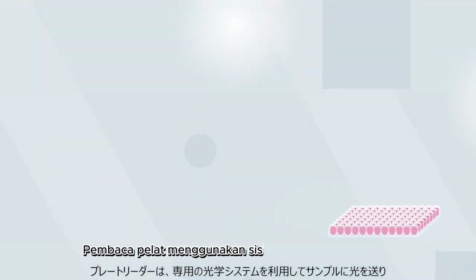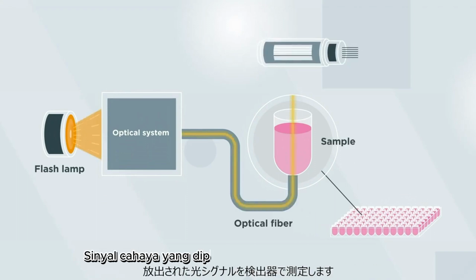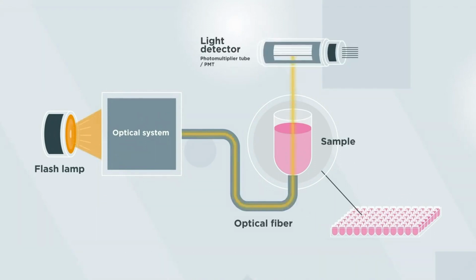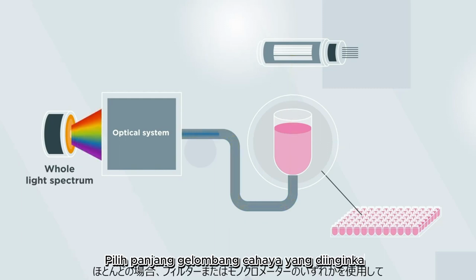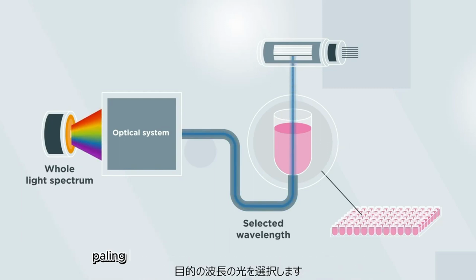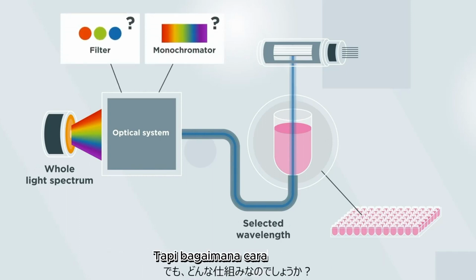Plate readers utilize dedicated optical systems to send light to your sample and measure the emitted signal by a light detector. In most cases, the light of the desired wavelength must be selected, using either a filter or a monochromator. But how do they work?